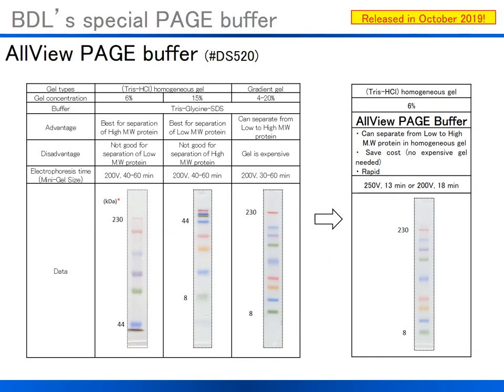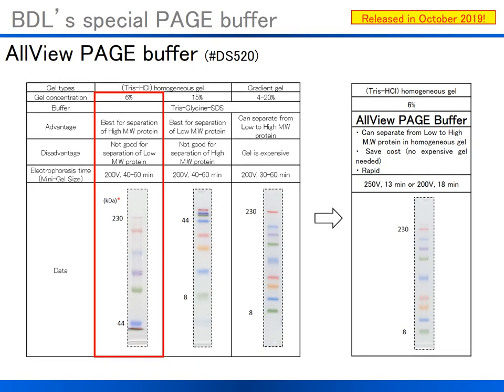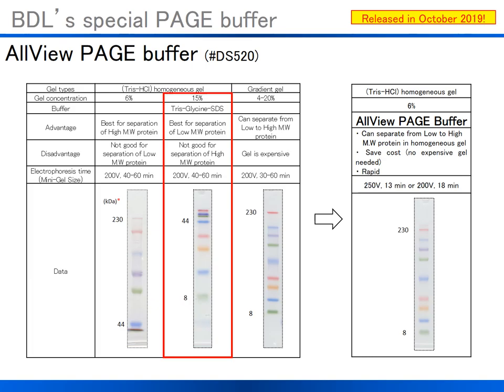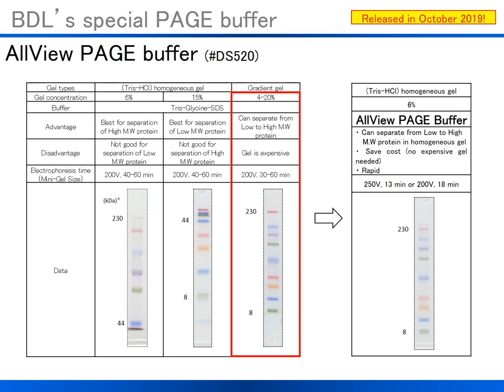This is a comparison data between 6%, 15%, and gradient gels, and 6% with our AllView Buffer. You can see here in the red box, using 6% gel with typical Tris running buffer, high molecular weight proteins are clearly separated but low molecular weight proteins are poorly separated. On the other hand, a 15% gel concentration gives good resolution of low molecular weight proteins but poor resolution of high molecular weight proteins. In a 4 to 20% gradient gel concentration, low to high molecular weight proteins are clearly separated with good resolution for both. On the far right side, AllView Page Buffer with 6% homogenous gel gives similar protein separation resolution compared with gradient gel.